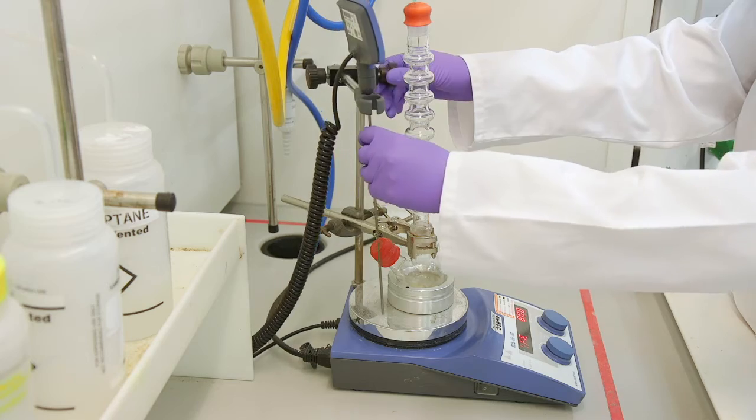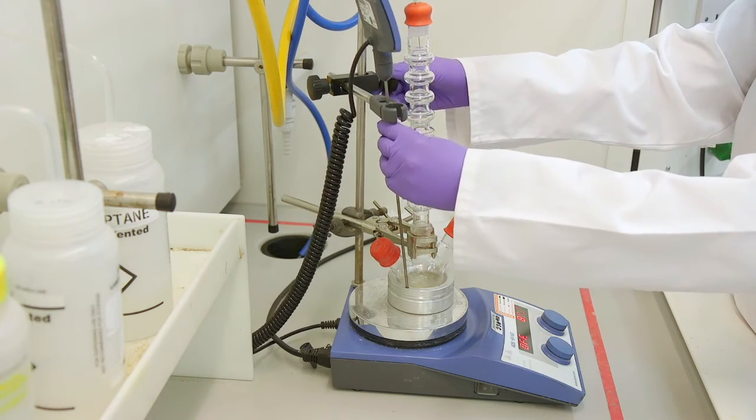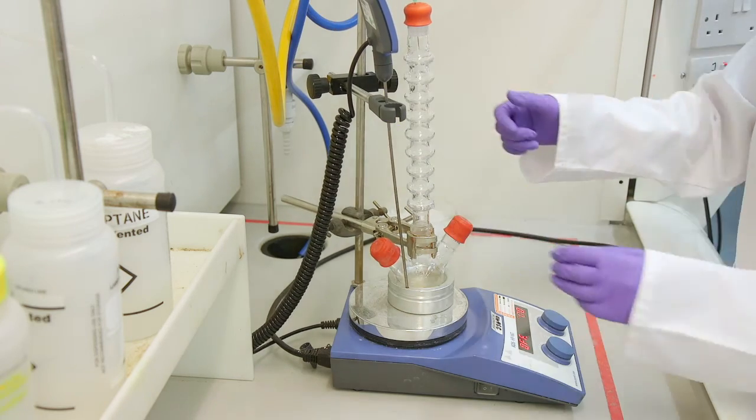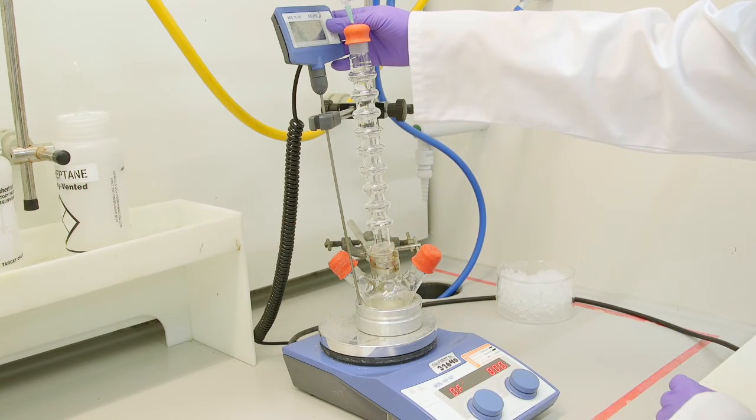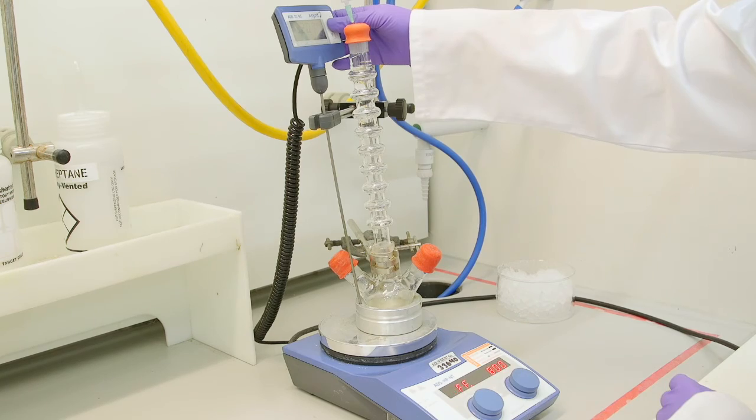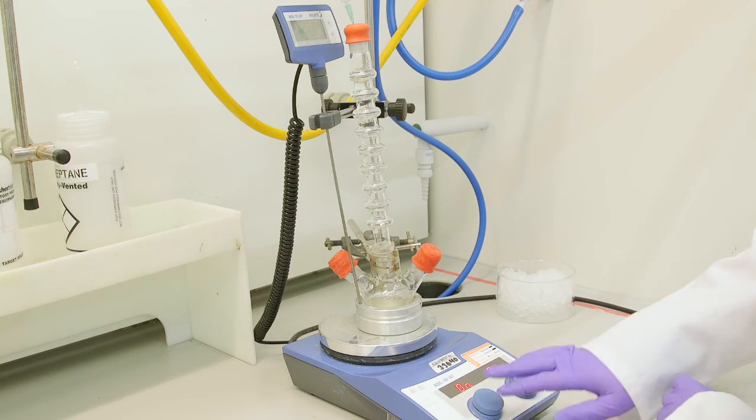The reaction can be monitored by titration to see if the product has been formed. Once you are happy you have reached a successful concentration of your Grignard or your reaction has been heating for five hours the reaction can now be stopped.